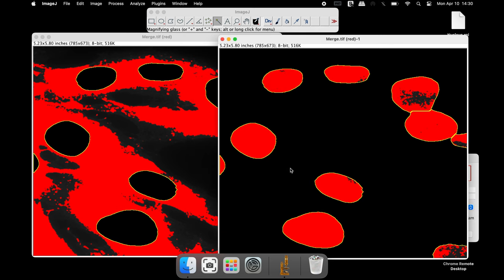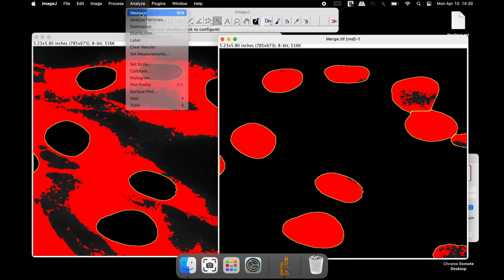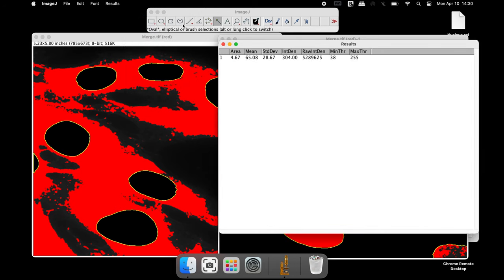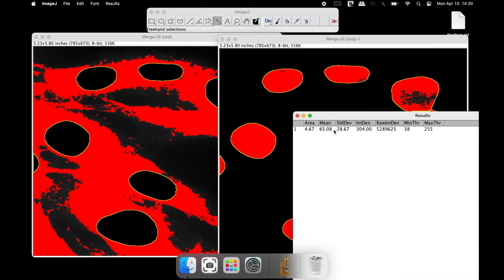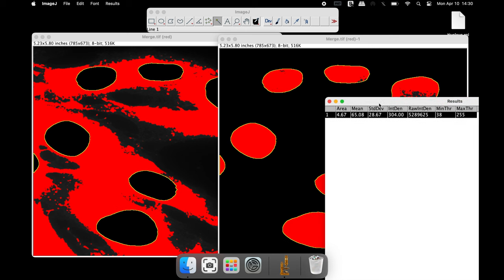To measure the mean fluorescence intensity of the nuclei, click on Analyze and Measure. In the results window, the area, Mean Intensity and Integrated Density is displayed.